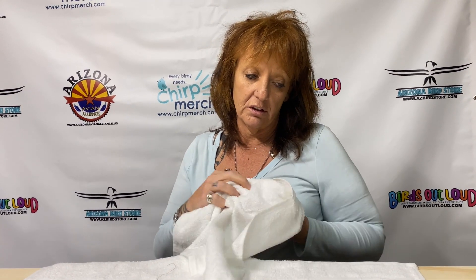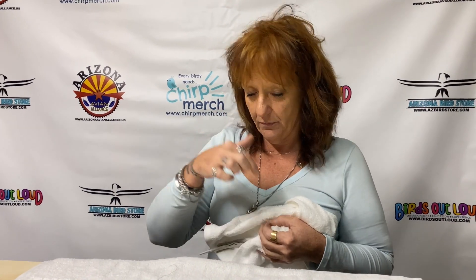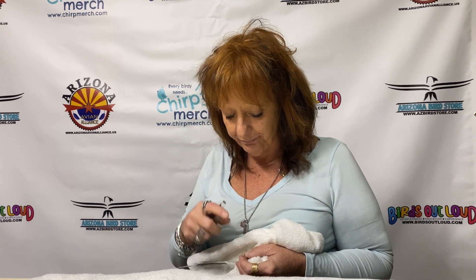You can do DNA sexings not just by getting some blood from the toenail like I'm going to do, but you can also pull a blood feather and send it off, or you can take the egg that the baby came out of and send that off and they can pull some DNA from that also. But today we're going to do it from a toenail.